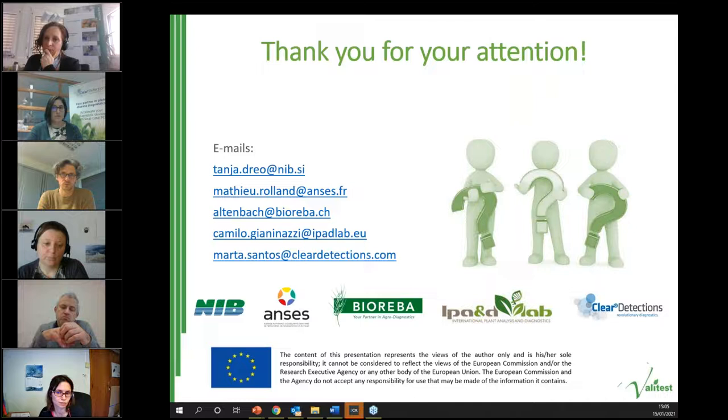So there is a question from Mathis Nas. How do you select the number of samples? If I'm validating a test in which we will process hundreds of thousands of samples a year, how many samples should the validation include?